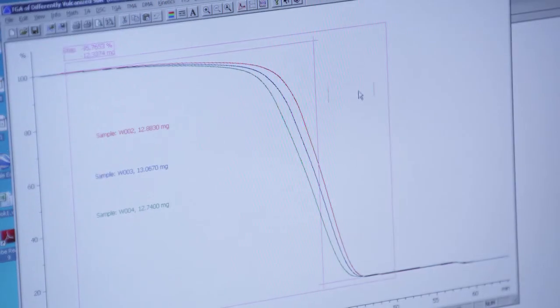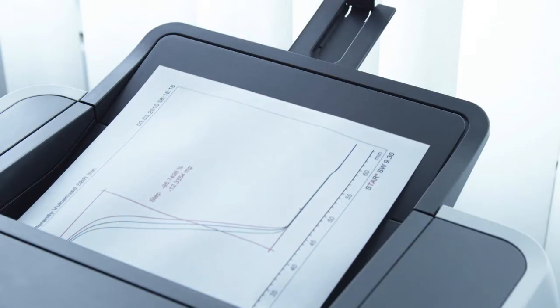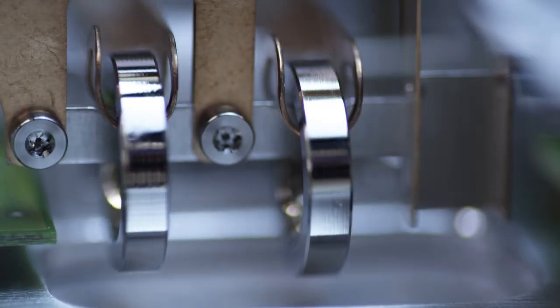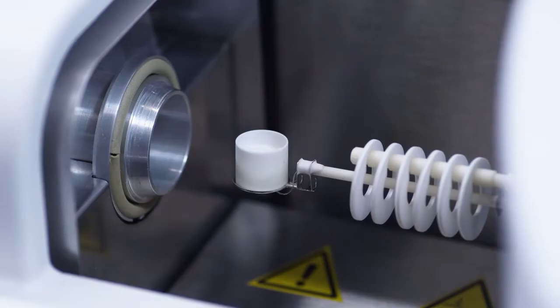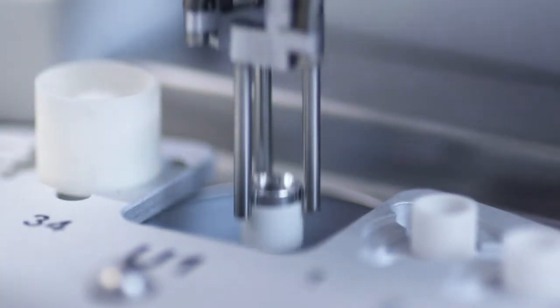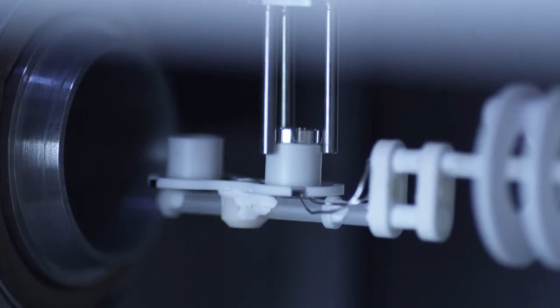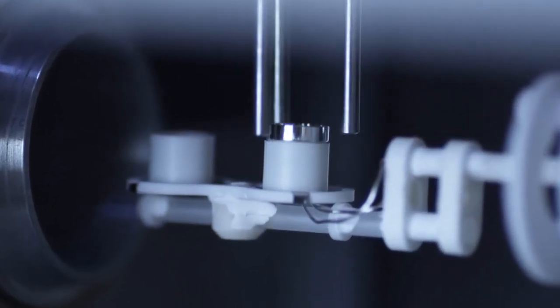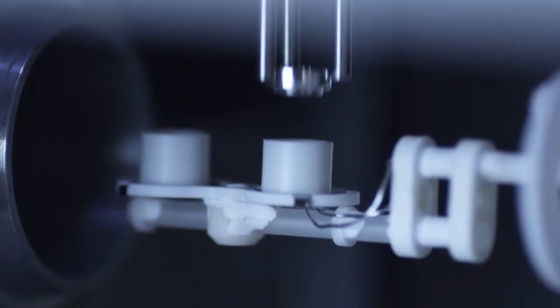The powerful STAR software provides unrivalled flexibility and almost unlimited evaluation possibilities. Innovative technology, versatile modularity and Swiss quality. Thermal analysis excellence is the perfect solution for accurate simultaneous TGA DSC measurements.